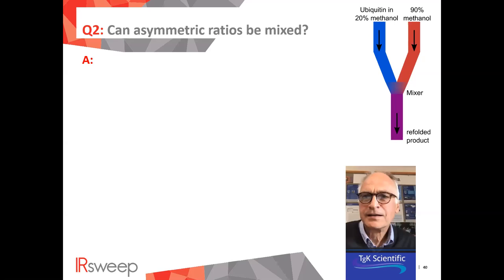Thanks a lot. Another one which came in is, could you explain briefly your project devoted to the study of surface monitoring? So we're currently starting, like I just mentioned, the diffuse reflectance project. To be honest, we haven't really gotten so far at the moment. So I think there will hopefully be another webinar on that at some point. We've also done ATR spectroscopy, which obviously probes the surface a lot, and that works very well. That's part of the measurements which I presented at the beginning, for example, the polymer chemistry, the curing we did on ATR. It's a good one, exactly.